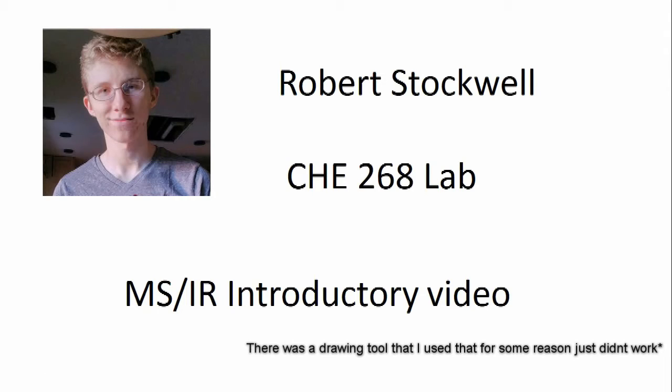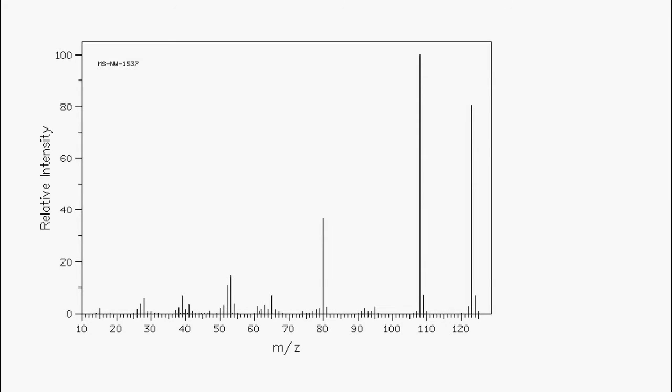My name is Robert Stockwell, and this is my Chem 268 Organic Chemistry Lab MSIR introductory video. First, we will look at an unknown molecule, and we will use our MSIR data to try and determine what the composition and structure of that molecule will be.